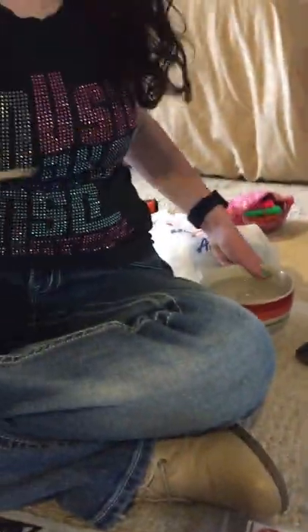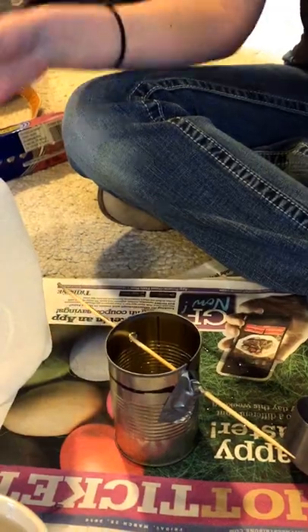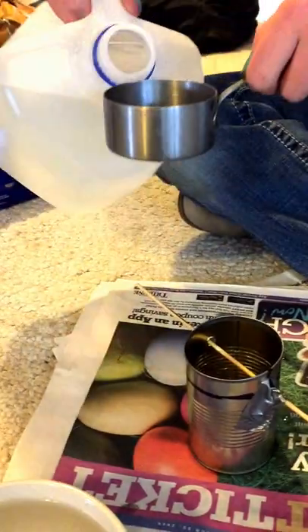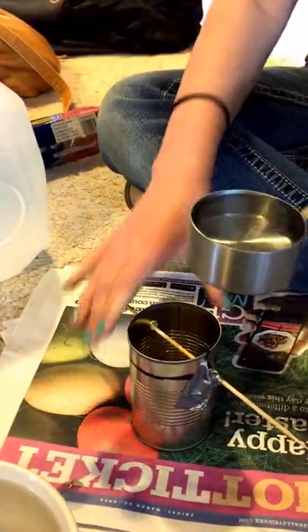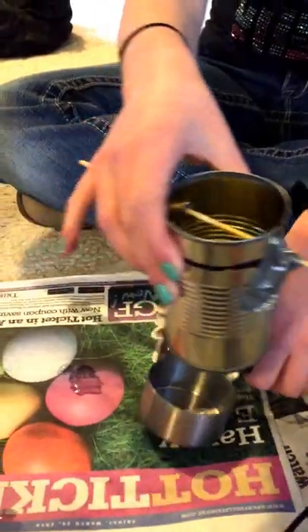So the first thing you want to do, and make sure the water you're using is distilled, so the minerals in the water don't affect the specific heat of the water. So we're going to measure half a cup of distilled water. Okay, and we're going to pour it into the top of our calorimeter. And then we're going to measure it with this fancy probe.